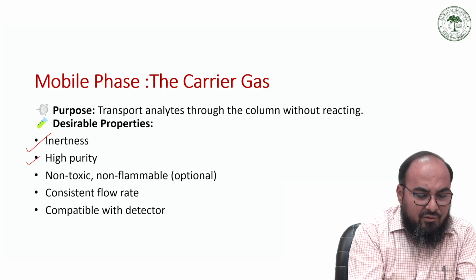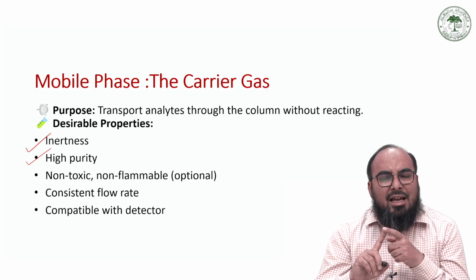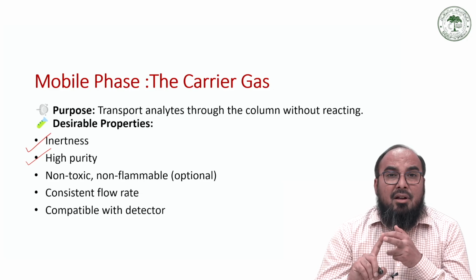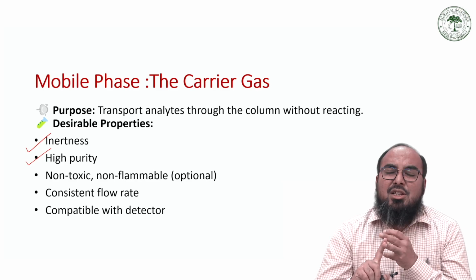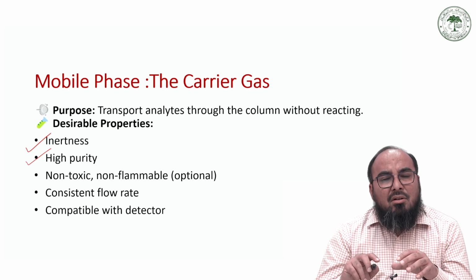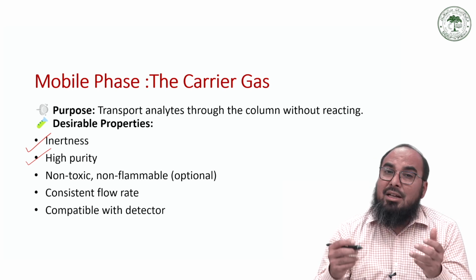Similarly, it must have the highest purity possible. That is, it must not have water content. It must not have any nitrogenous content or any sulfur gases. So it must be in the purest form possible, because otherwise it may lead to reaction, it may lead to a stronger interaction with the volatile components.